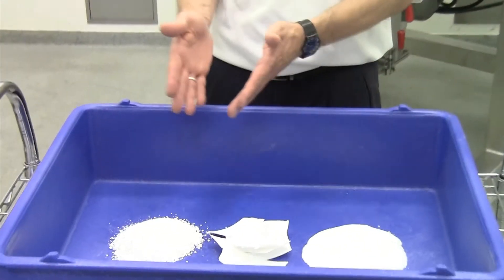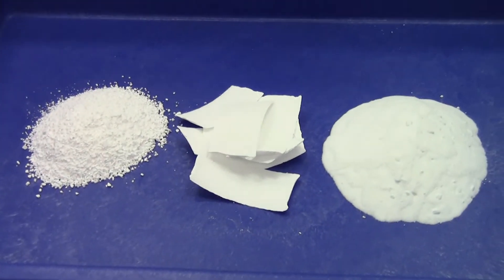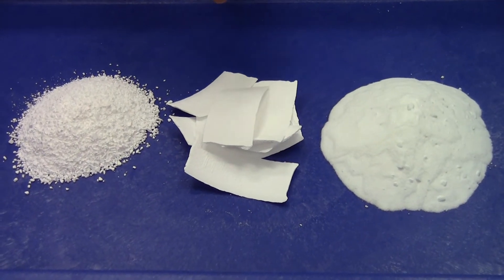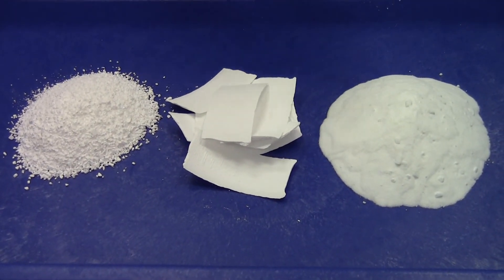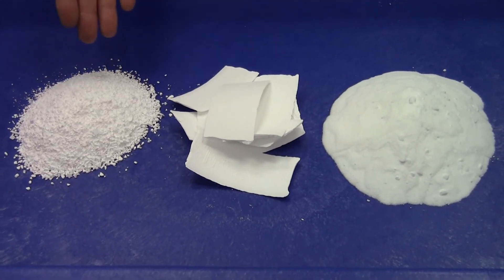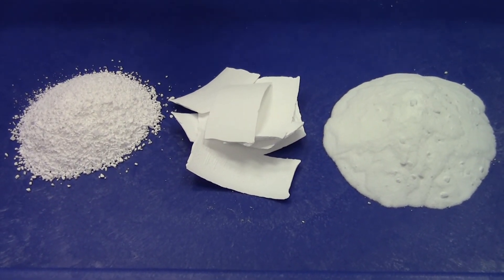Compaction is also known as dry granulation. Compaction is a part of the dry granulation process, normally known as the transfer from a powder to granular material. The step involving the roller compactor performs compaction — producing ribbons or flakes from powder — and then crushes them in a subsequent flake crusher.